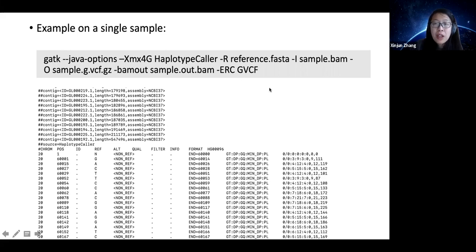If you have questions about the GVCF, say after the downstream analysis you look at your VCF and figure that there's some part that looks fishy, or you're interested in a specific variant. For example, at this gene on a particular chromosome, you think there should be a mutation that confers positive selection in a population. You want to make sure that the variant you identified is a real variant, not an artifact.